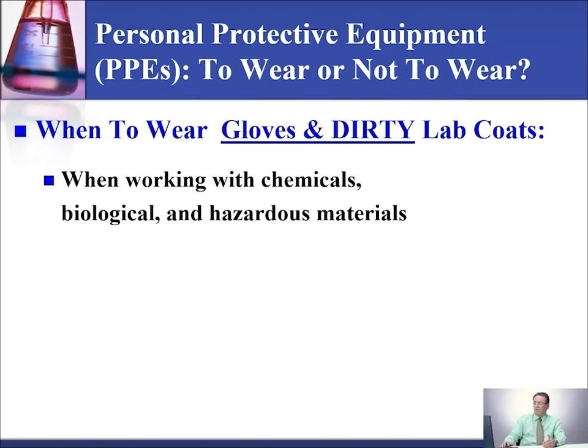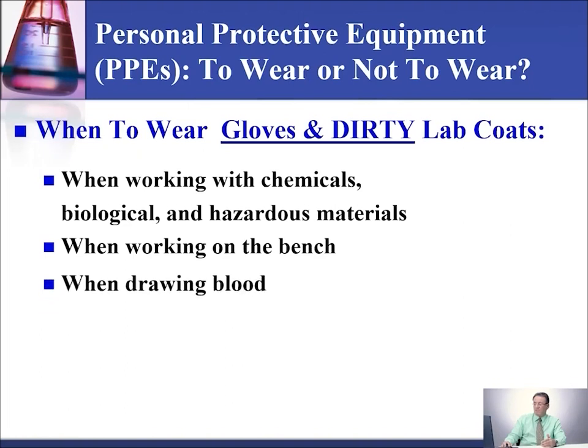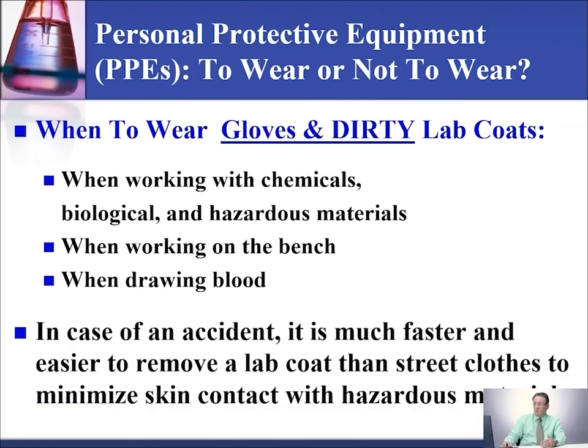So when to wear gloves and dirty lab coats? When working with chemicals, biological, and hazardous material. When working on the bench, meaning doing patient testing or things related to it. When drawing blood. In case of an accident, it is much faster and easier to remove a lab coat than street clothes, to minimize skin contact with hazardous materials.